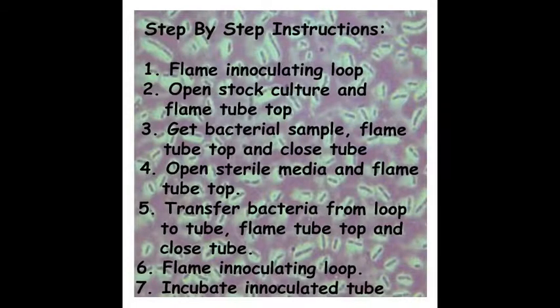Okay, now for the actual transfer. When you first start working in the micro lab, it may seem a bit awkward, but we will be making many transfers and it should soon seem easy to you.